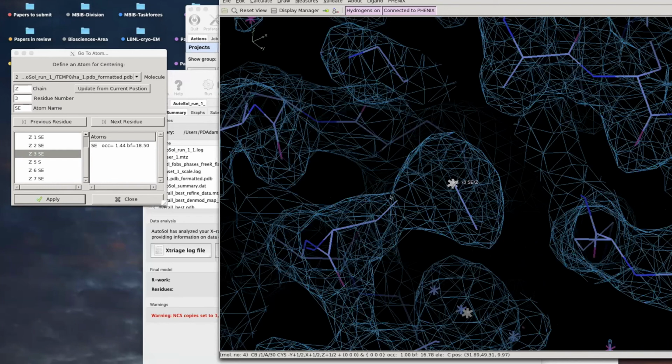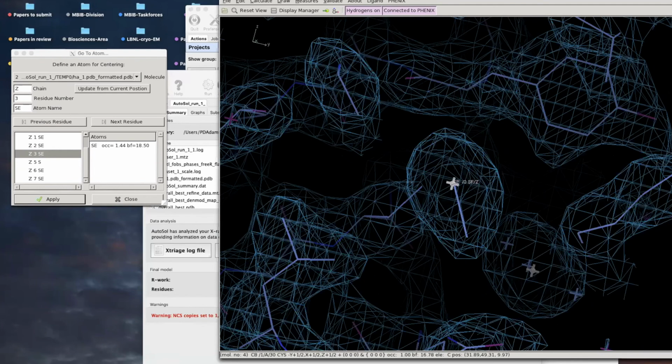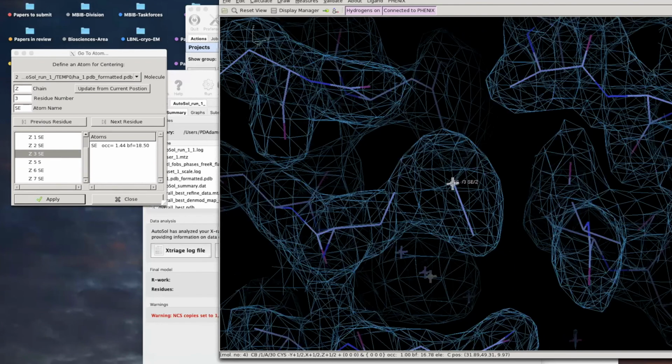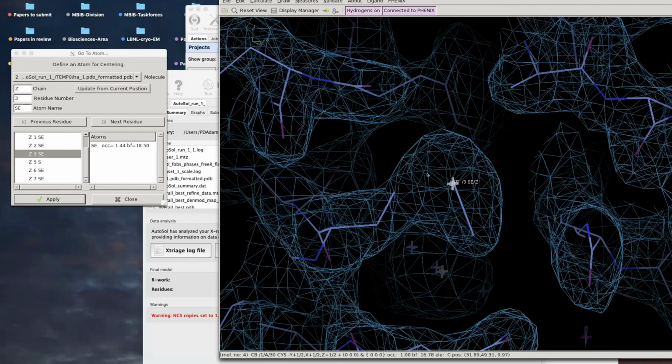So this didn't have really great geometry in the one Paul is showing here, so that Coot doesn't draw the bonds exactly the way you expected, but it did put a selenium at the location of a selenomethionine side chain. So back to answering the question about did it work?